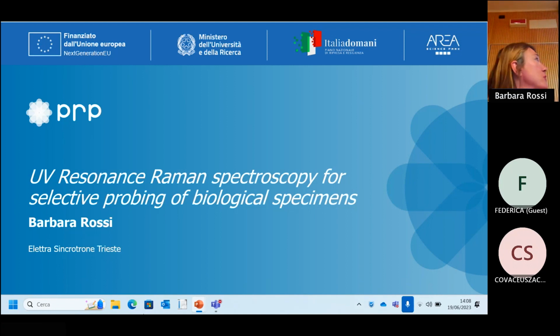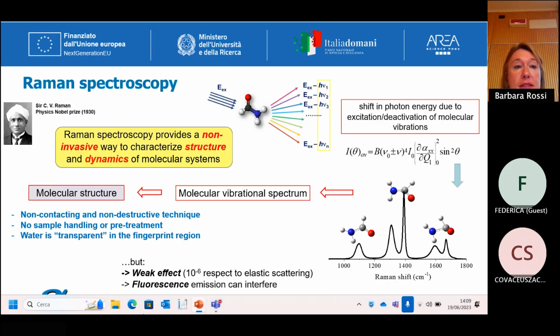I am Barbara Rossi from Elettra Sincrotrone Trieste, and we participate in the PRP project with our beamline IUVS, which is mainly dedicated to inelastic ultraviolet scattering. Today in this presentation, I would like to give you an overview of the technique of UV Raman spectroscopy, and in particular of the opportunities offered by this technique in the investigation of biological systems.